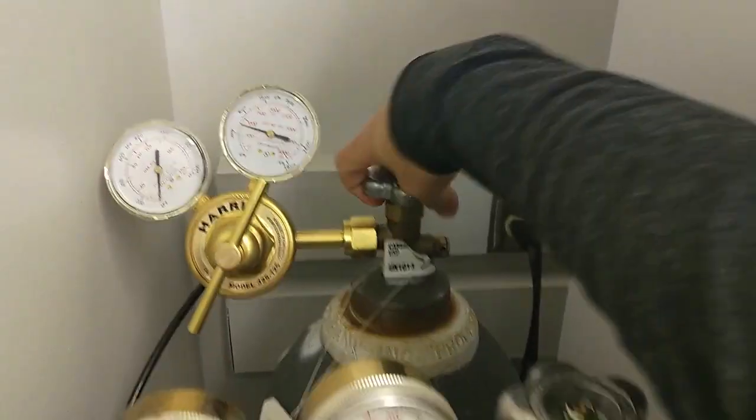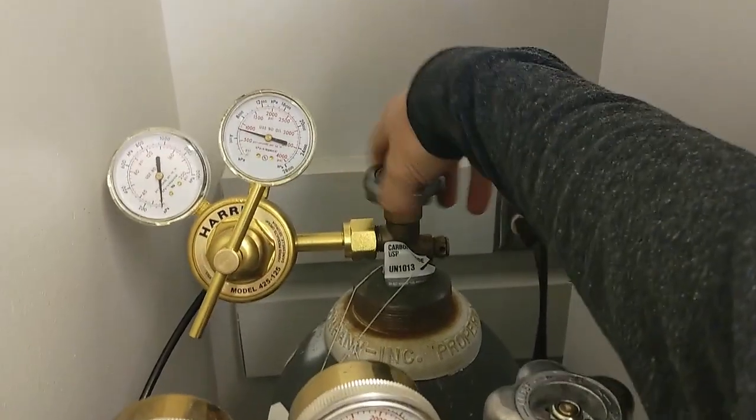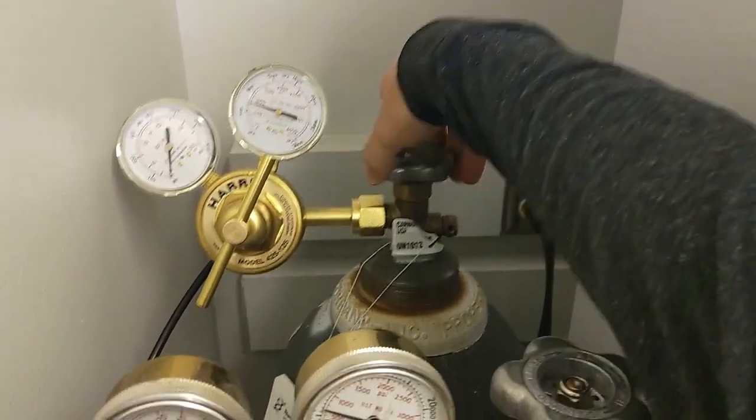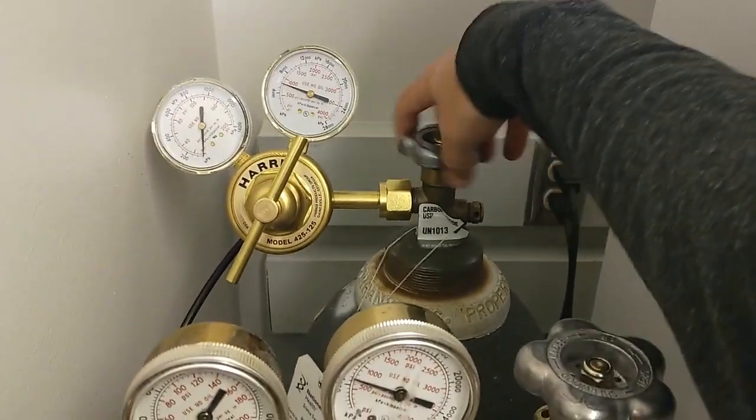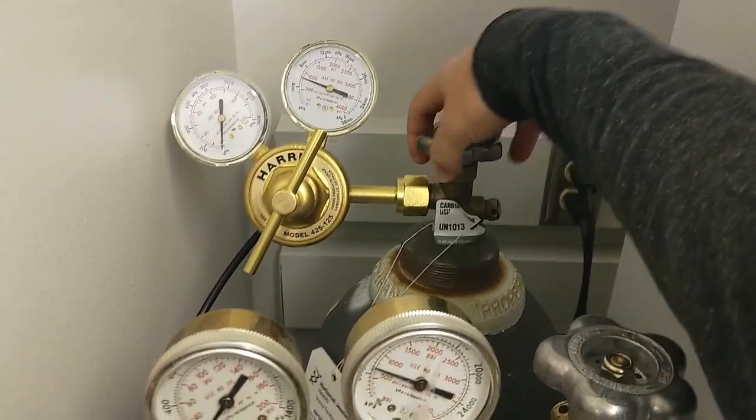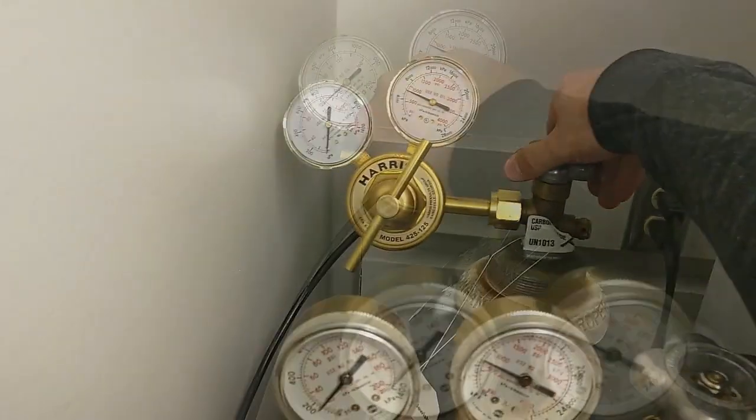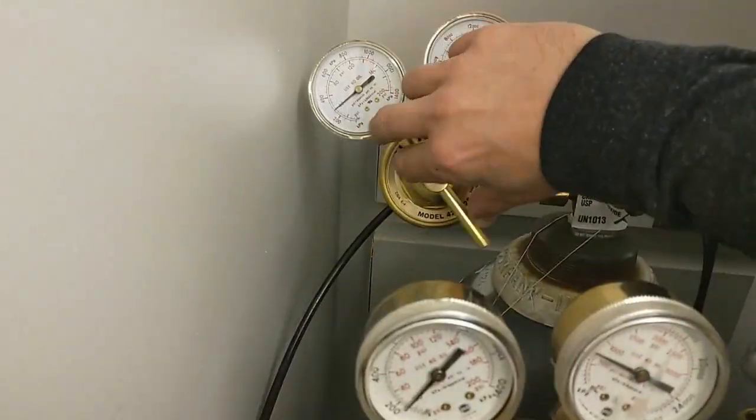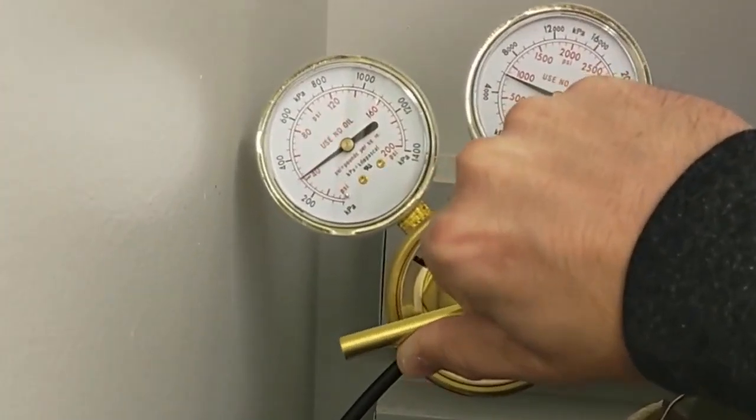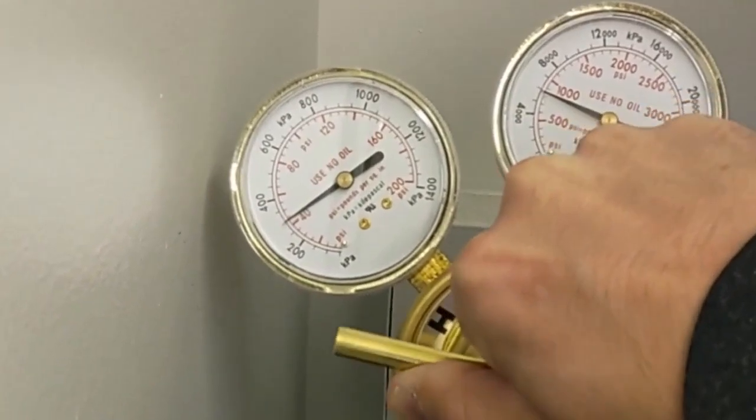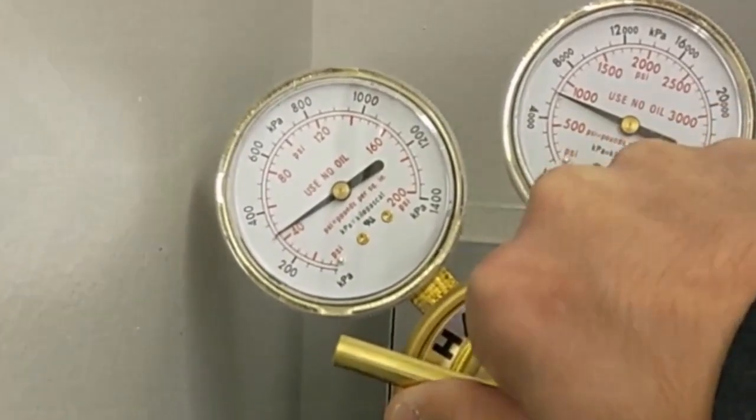Begin by opening the valve on each of the individual gas tanks configured for use with the OSI. Adjust the output regulators to a range of 40 to 50 PSI.